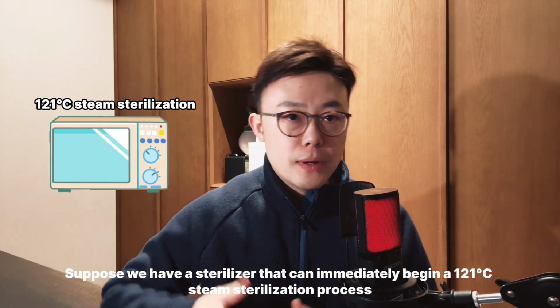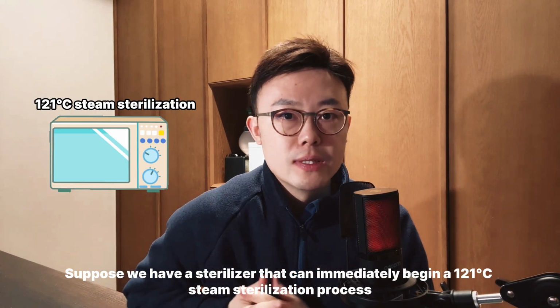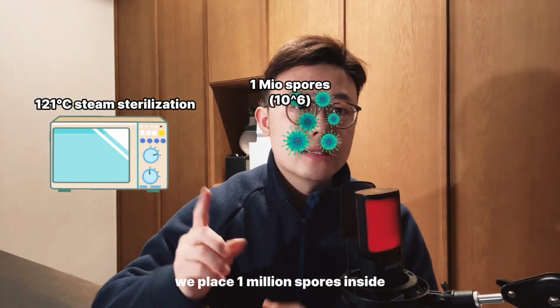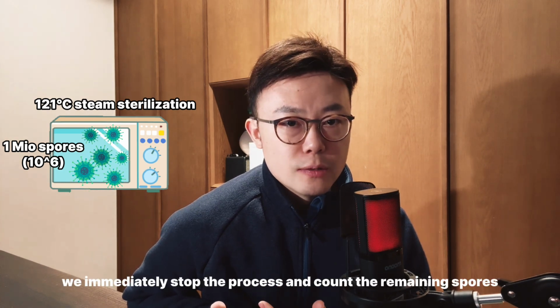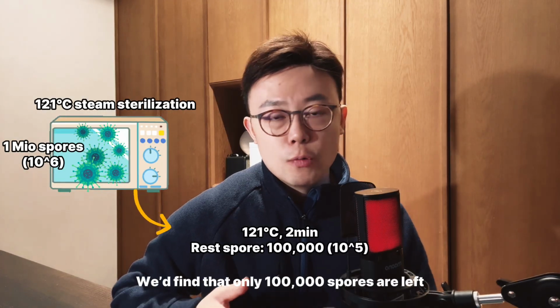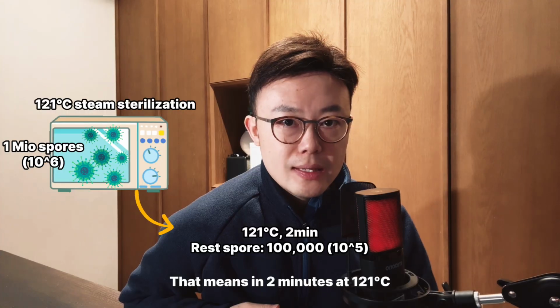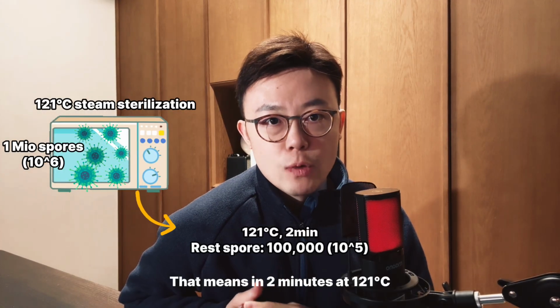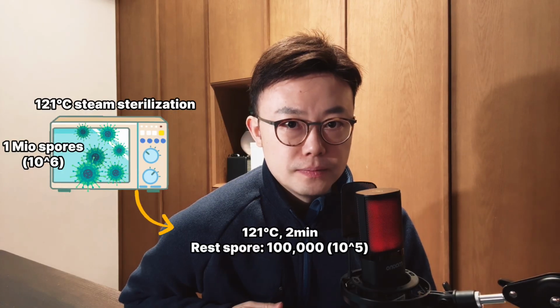Let's take an example. Suppose we have a sterilizer that can immediately begin a 121 degrees steam sterilization process. Now we place 1 million spores inside, close the door and start the cycle. After, say, 2 minutes, we immediately stop the process and count the remaining spores. We find that only 100,000 spores are left. That means in 2 minutes at 121 degrees, 900,000 spores were killed.